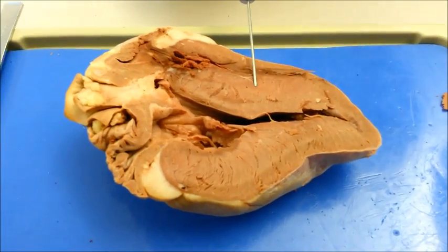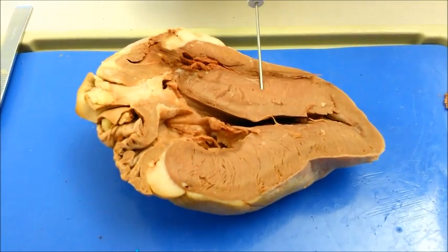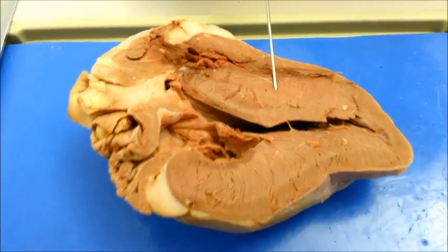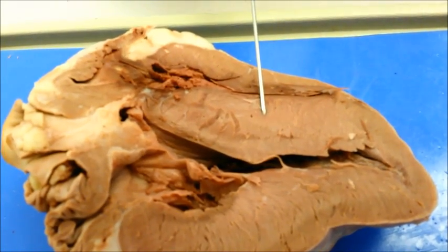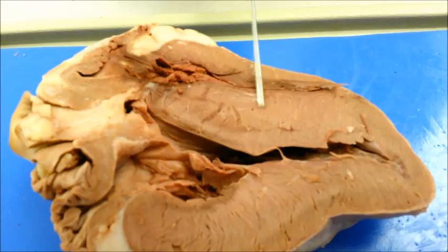The interventricular septum is the muscular wall between the right and left ventricles. The greater part of it is muscular and thick while the upper portion is thinner and more fibrous. The upper portion separates the aortic vestibule from the lower part of the right atrium and the upper part of the right ventricle.